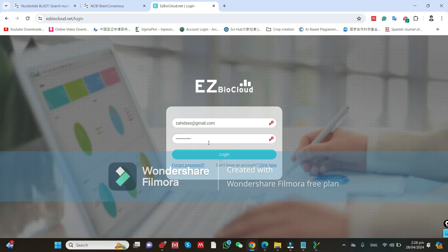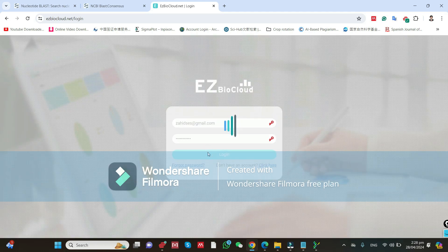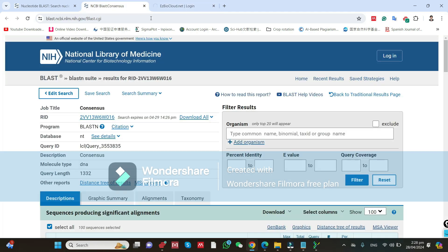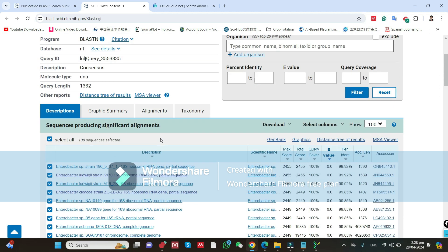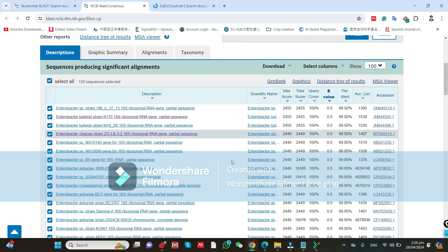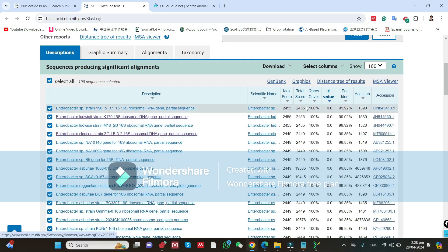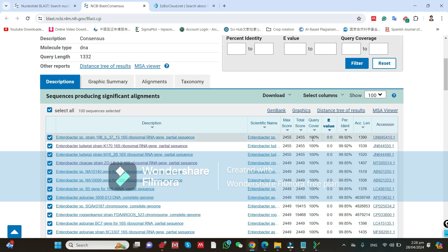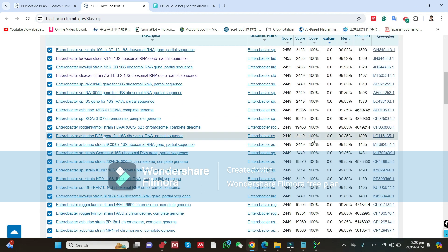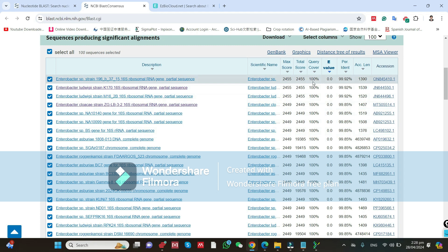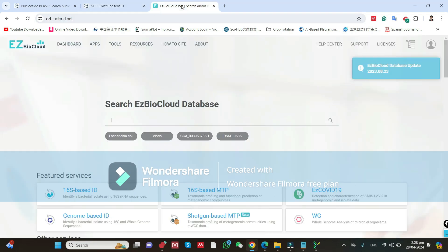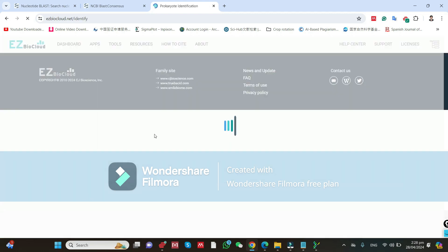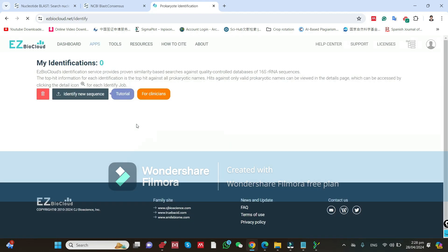Enter your username and password and log in. In NCBI, you can see the BLAST results, but all these queries show 100 percent similarity, which makes it difficult to select which strain it could be. So, I mostly use EasyBioCloud — go to '16S-based ID' and click it.